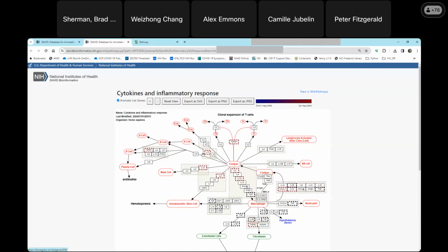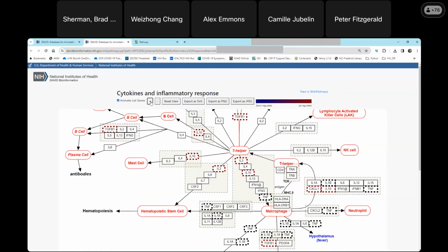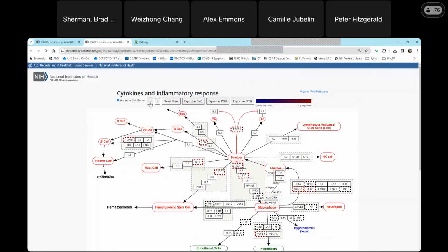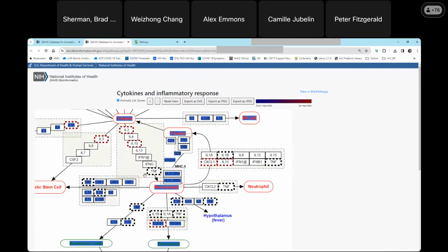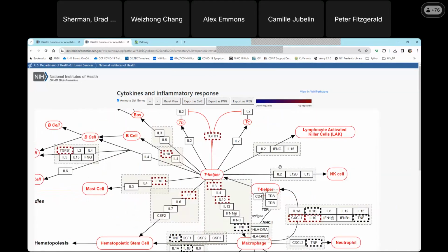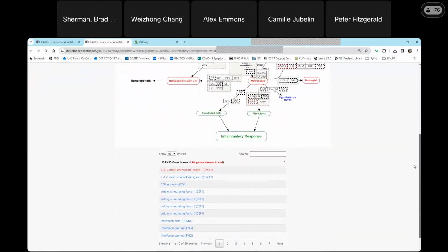But some other things that we can do with this, again, we can stop this animation or start it. We can zoom in and out. So we're not using the browser controls anymore. We can use it within the pathway viewer. Some of these pathways are very big, so I can drag it, pan it around. I can reset that view. I have exports for different formats here. And then, of course, we have the link out to WikiPathways itself.